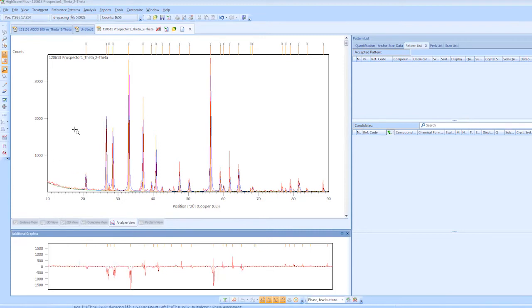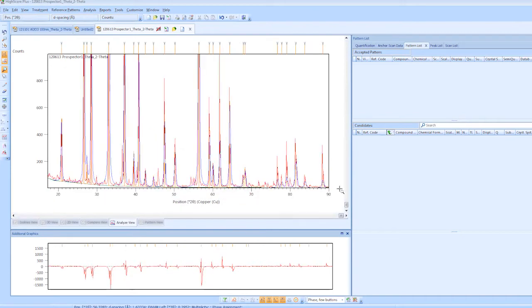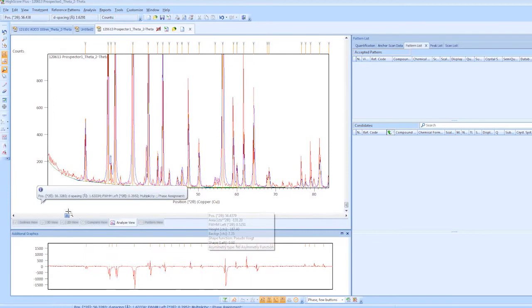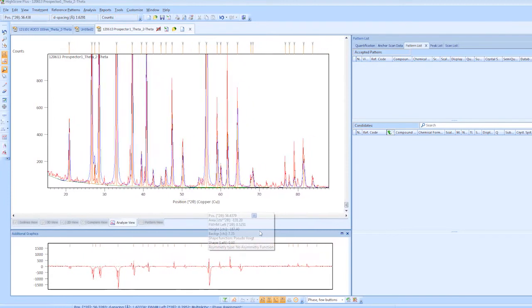Okay. So I'm going to go through. Okay, so it got a lot of these. There's a lot of the small peaks that really don't come up. So I'm going to go ahead and start adding some peaks here. There's definitely one peak there. Maybe one small one there. Not sure about there. We'll see how that goes. Okay.